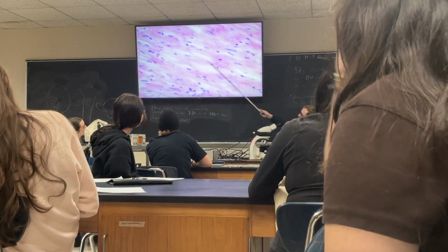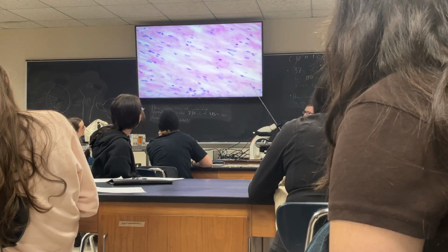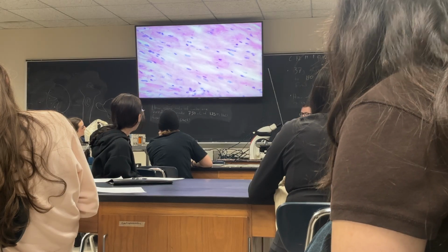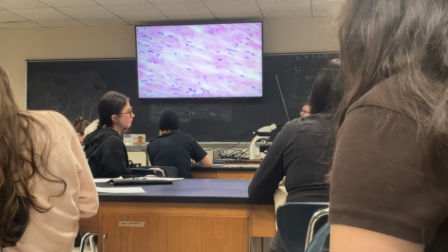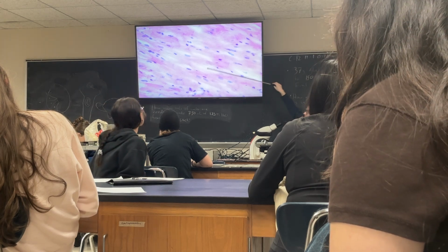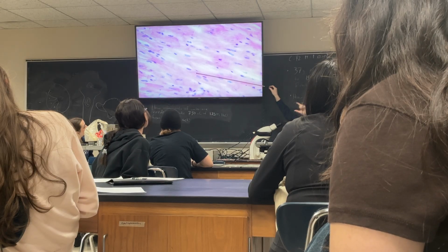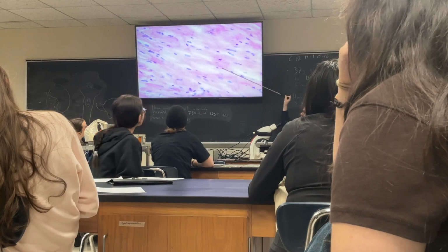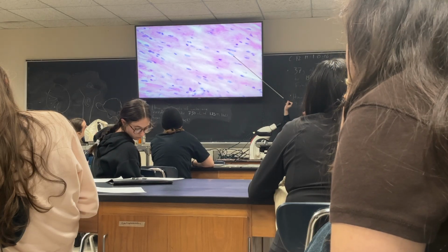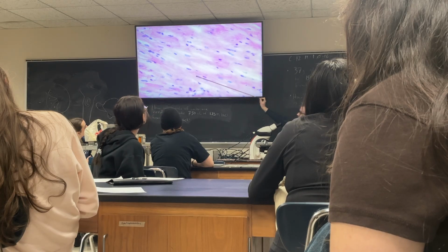Do you see these protein fibers wisping left and right? Can you kind of see that? Okay, so if this were smooth muscle, then it would be cutting it as it's traveling like this, and we would see those nuclei nice and oval. They'd be stretched because we can tell that it's going left to right. And these nuclei are not stretched like that. That one is. They all look like that one. Instead, these guys are a little bit rounder.